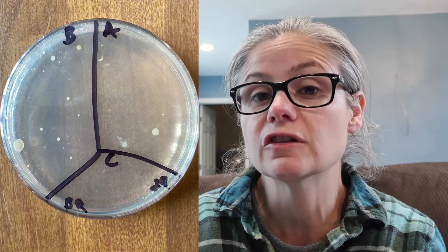The bathroom rug — in the before section we can see some bacteria. Again it's not a huge amount; it's about two dozen small bacterial colonies. And in the after section there is a decrease — it's down to about half a dozen bacterial colonies. So the Tide Antibacterial Fabric Spray does an okay job at removing the bacteria from my bathroom rug.